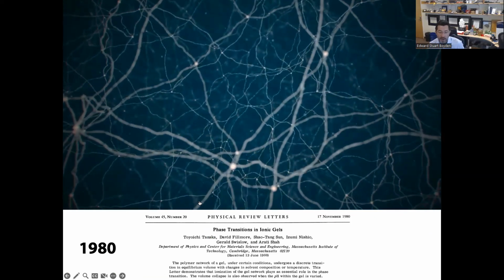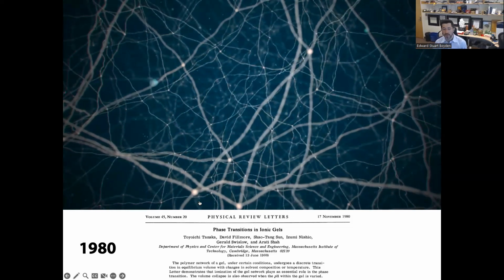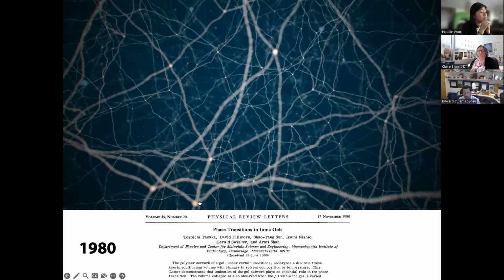The polymer threads are highly charged, and they separate apart from each other. So this gives this enormous expansion within a matter of minutes. And furthermore, the physics of this is well behaved, and that was one of the things that got us thinking, well, maybe this is something that we could try to apply to evenly expand a biological system.